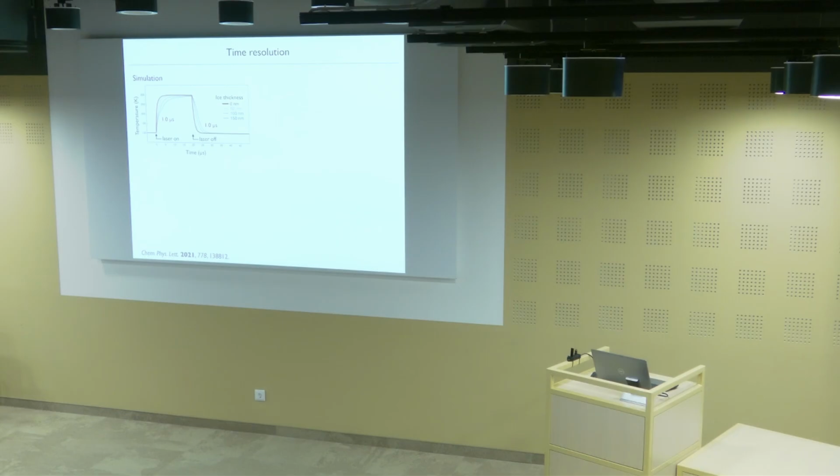So this is really nice for a kinetics experiment. And then once you switch the laser off, the sample cools down again with a time constant of about 1 microsecond and goes back to cryogenic temperature. Right? And so experimentally, we get very similar timescales. Right? So I'll explain in 2 words how this experiment works.